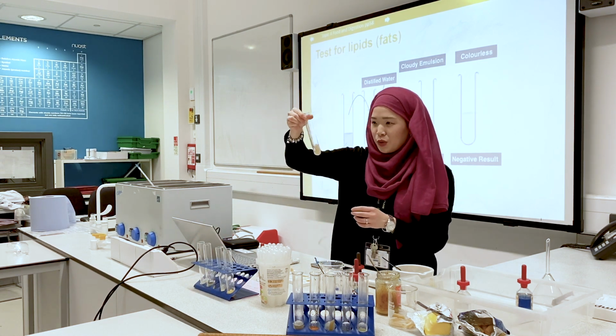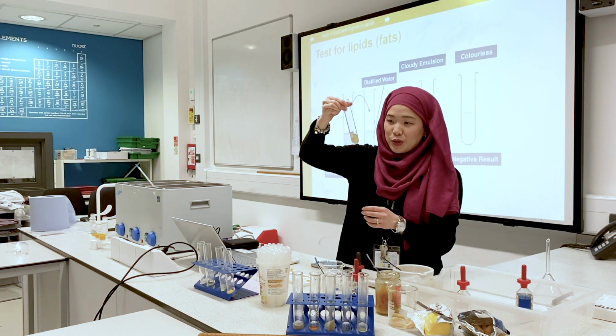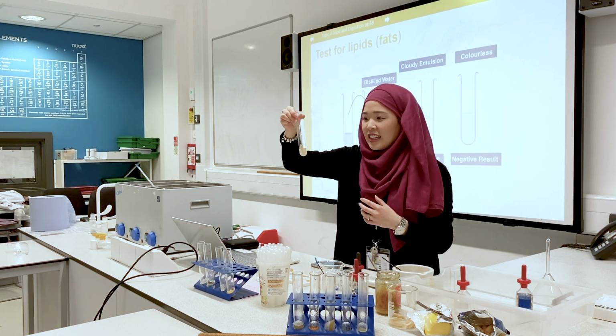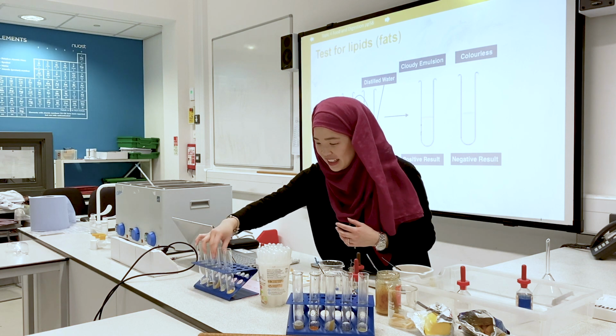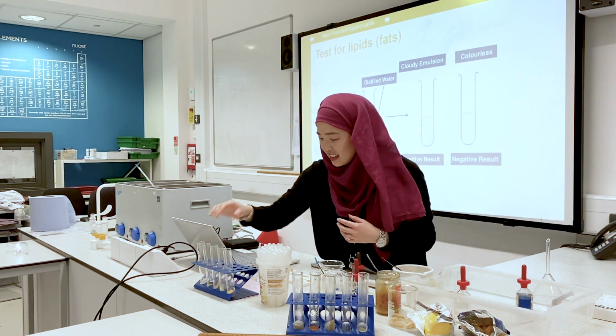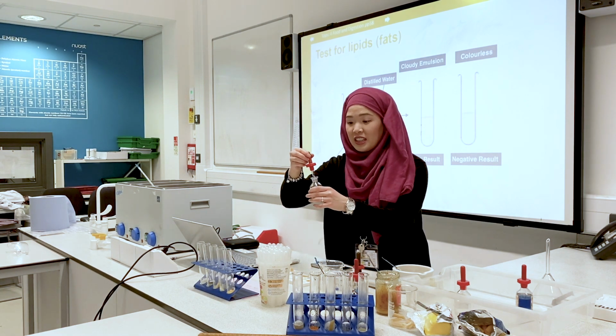If the pasta was softer and mushed up, it would probably show a better result, as you would have chewed the food and then the digestion would begin within your body. But we are just testing this to see if lipids are present.